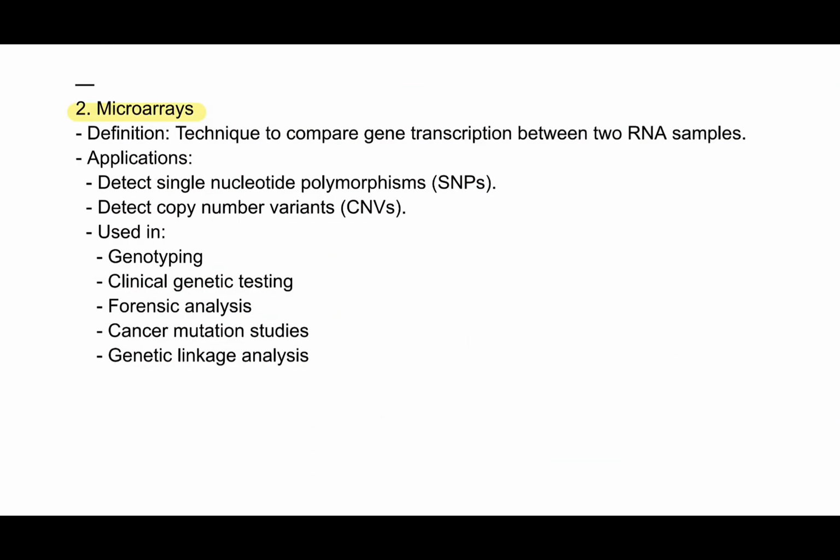Second technique is microarrays. Definition: microarrays are a technique to compare gene transcription between two RNA samples. Its applications: detect single nucleotide polymorphisms or SNPs, detect copy number variants, CNVs. Microarrays are used in genotyping, clinical genetic testing, forensic analysis, cancer mutation studies, and genetic linkage analysis.